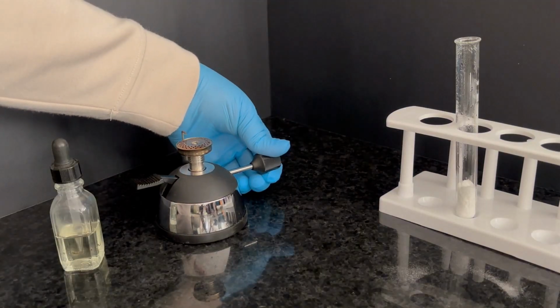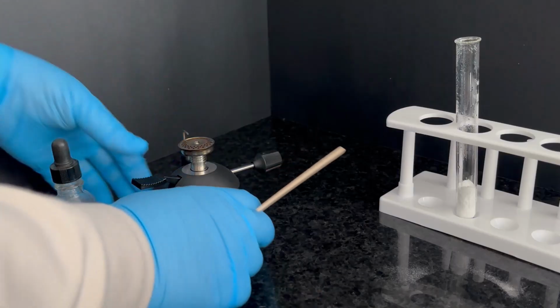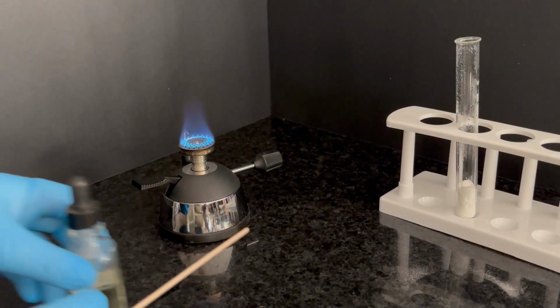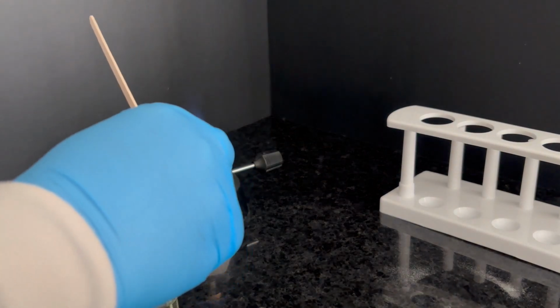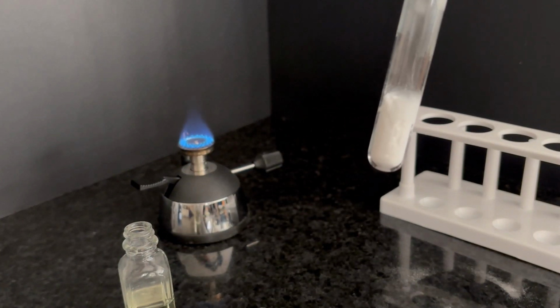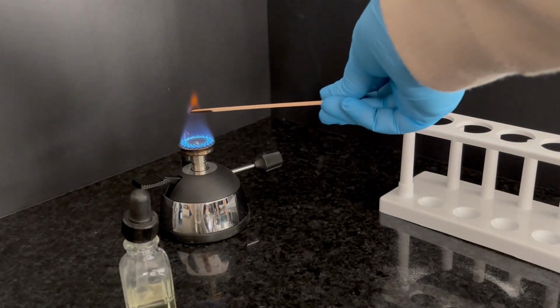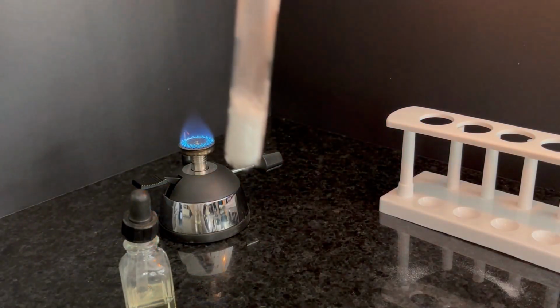Finally, we'll see what gas forms when the sodium carbonate product in the test tube reacts with hydrochloric acid. See the gas forming? Now we'll determine what type of gas it is by observing how a glowing splint acts when placed in it.